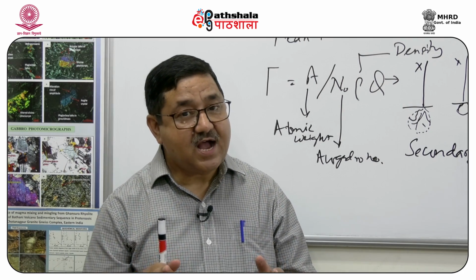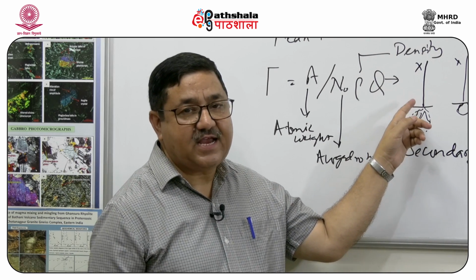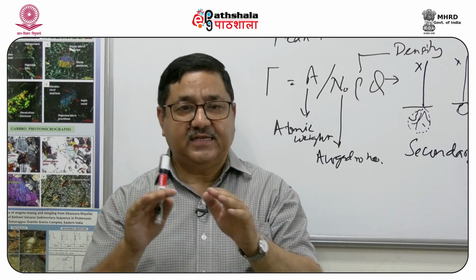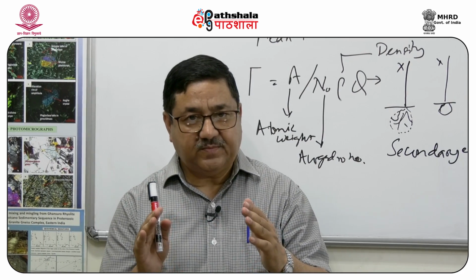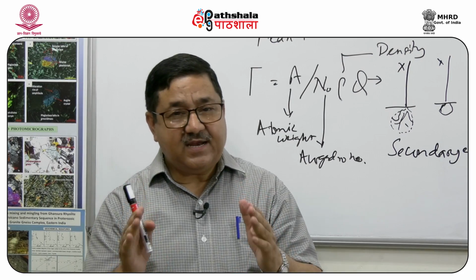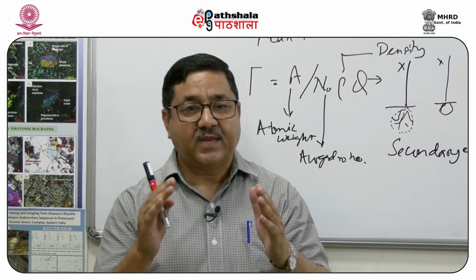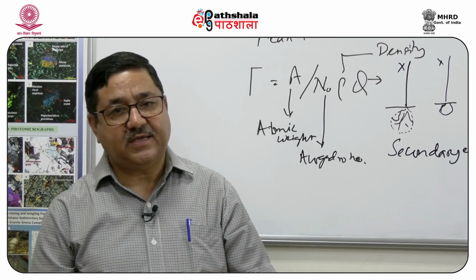Now, those are very useful because they come out from the top surface of the interaction volume, and they define the shape and the figure of the interaction volume, and they are used as a very nice criteria to distinguish at high resolution, and we will discuss resolution subsequently, high resolution the material which we are examining.